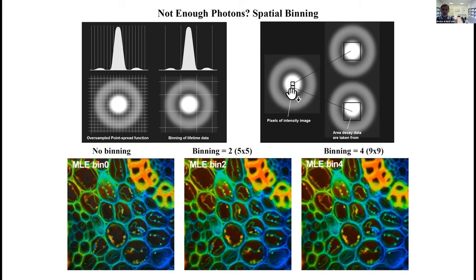Binning does not reduce the effective number of pixels. It only gets the decay information from a larger area around the current pixel. Here's an example. This is no binning—you see the result is noisy. This is binning five by five, as I suggested. The image is very good, no noise in the lifetime. If you even go up to binning nine by nine pixels, it essentially looks the same. Only if you look into very fine details, like this feature that looks like a stalk, the colors have blurred a little bit. Now binning nine by nine was too much.